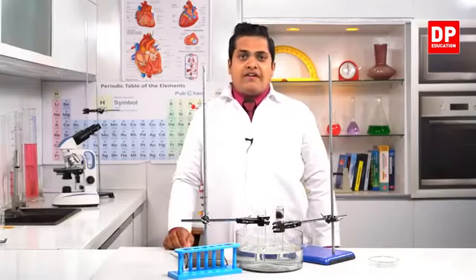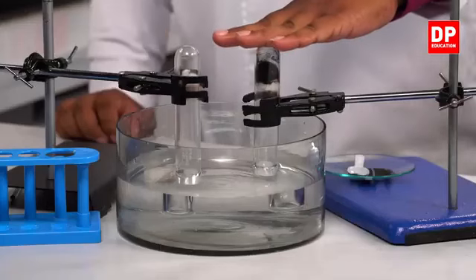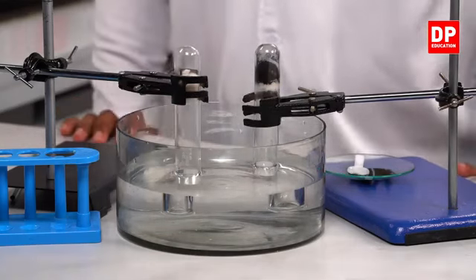Right, so I have fixed both the boiling tubes up to the same level, and you can observe that they are at the same level right now.